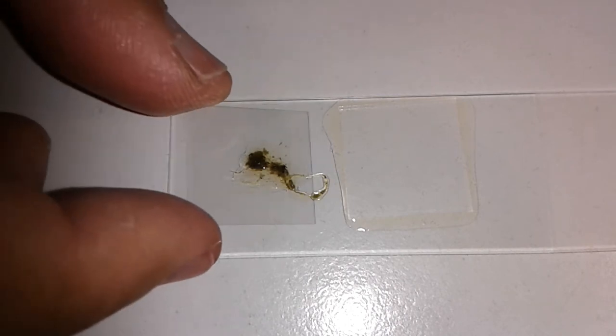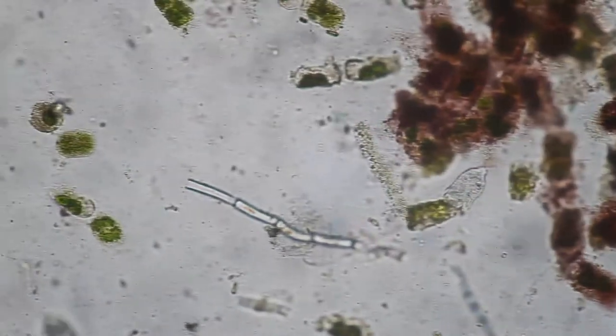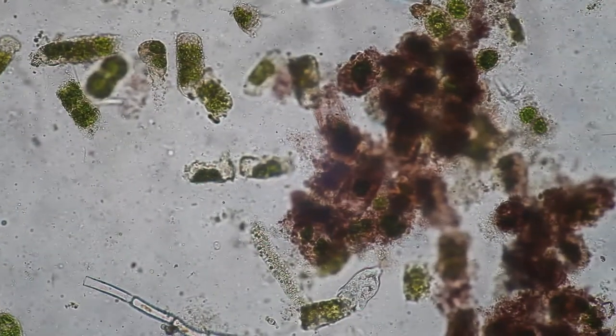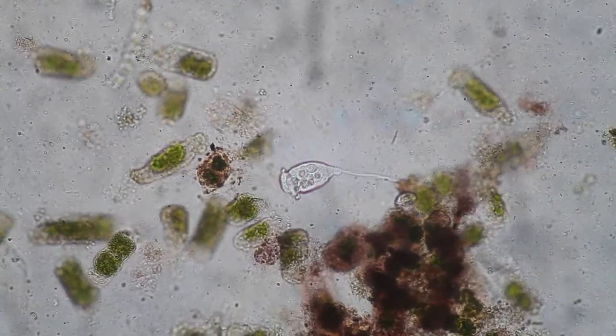But what I'm doing right now is a so-called voiceover. So I'm watching my video that I made. I removed the original sound, and then I'm simply talking into my little MP3 recorder and narrating what you can see. So this is the slide with the water sample, and you can see there are many water organisms and also a lot of unidentified debris. This seems to be a vorticella. Yeah, it's a ciliate.